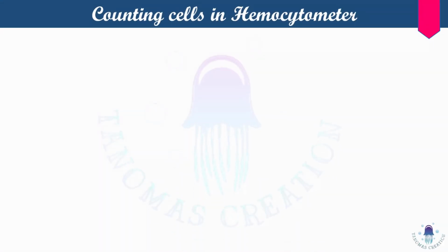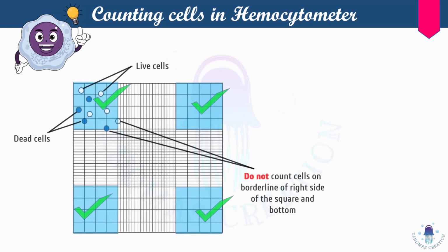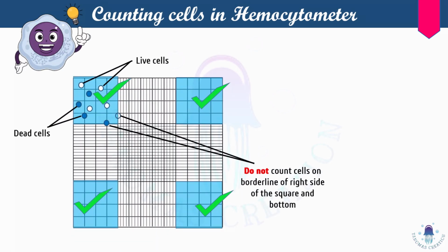So now there are some rules and regulations that we follow while counting the cells in this hemocytometer. Here you can clearly see that the colorless cells are the live cells and the stained cells are the dead cells.